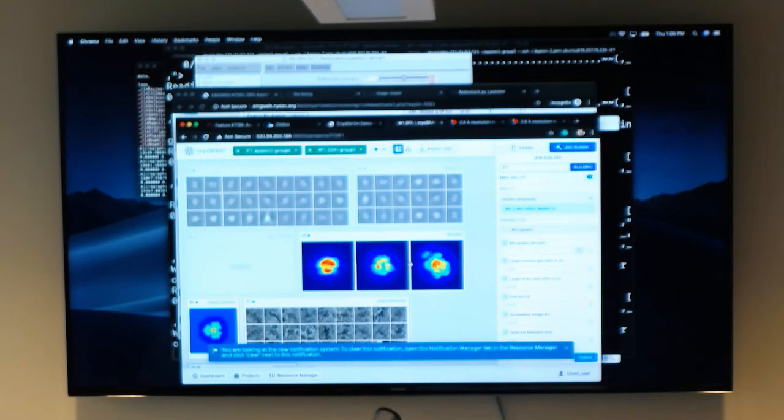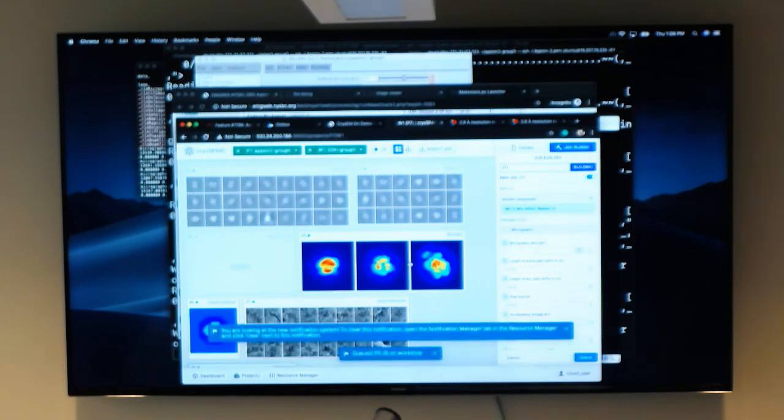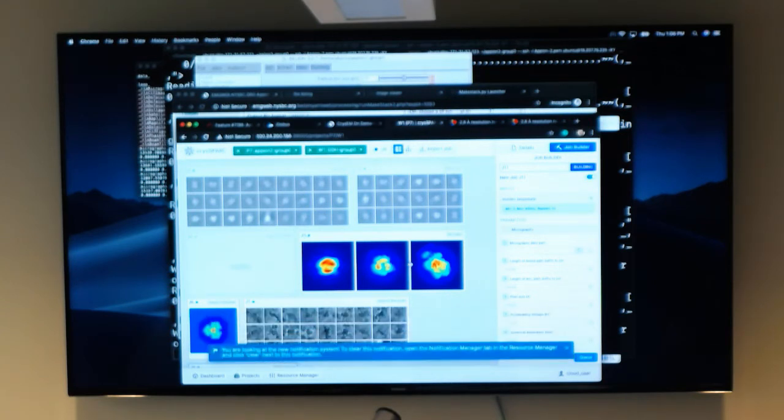And if we don't, then we can run again. I don't think so. We just need to find. Yeah, it's working, this one. It's not really. But what has symmetry got to do with working or not working? Sixfold. Sorry? 6 times more asymmetric units. 6.